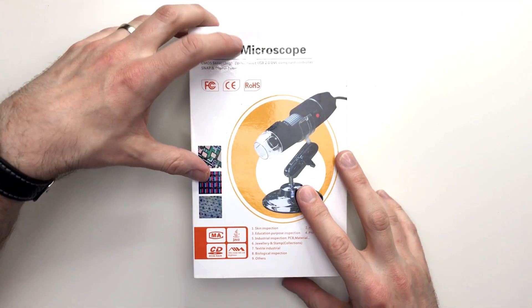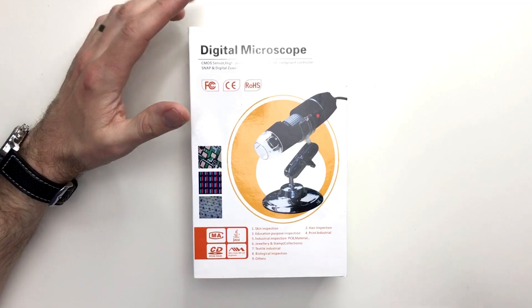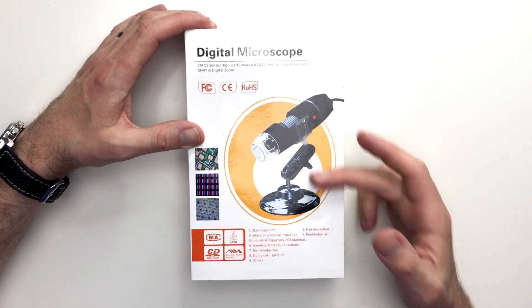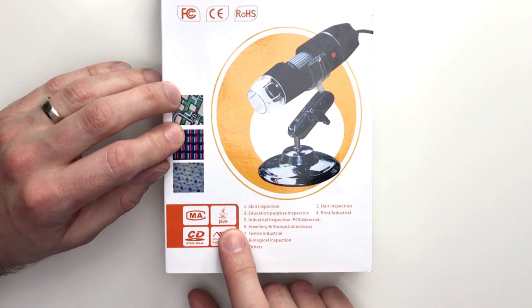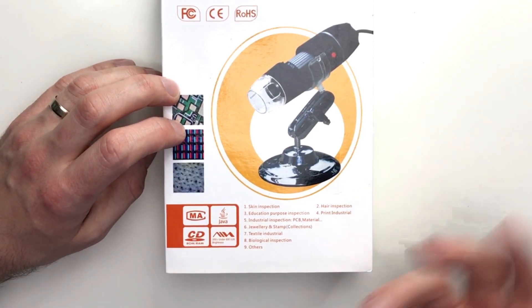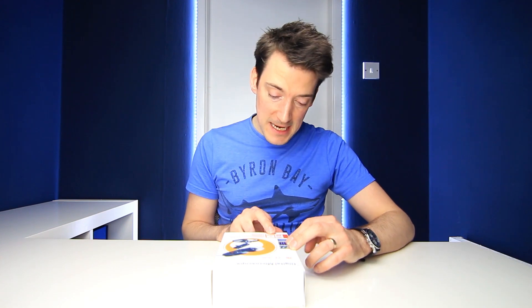So as usual, starting off with the box — it looks quite scientific and it's got no excruciating or bright design to really attract you to it, however it does obviously have a picture of the microscope on the front. As for the description, it looks like you've got your Java enabled, it comes with a CD-ROM, and there's a little note here: 30 frames per second under 600 LUX brightness. That's quite good really, it's not the best, but it's pretty decent.